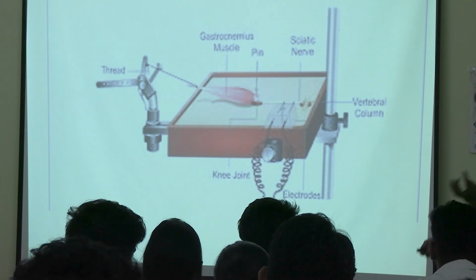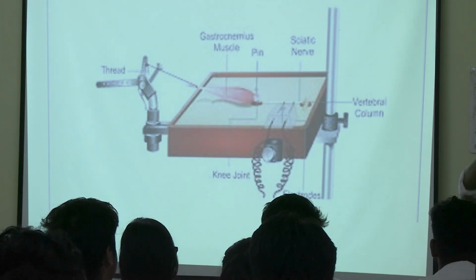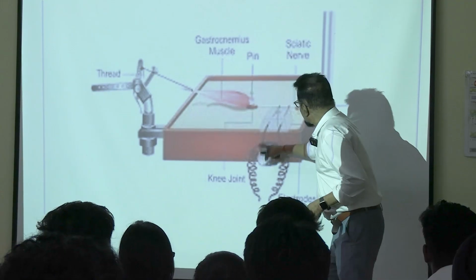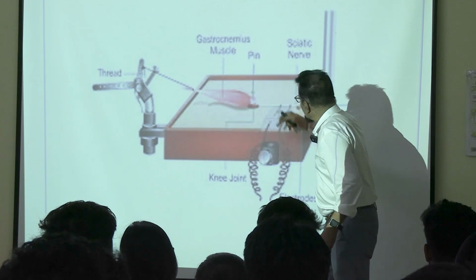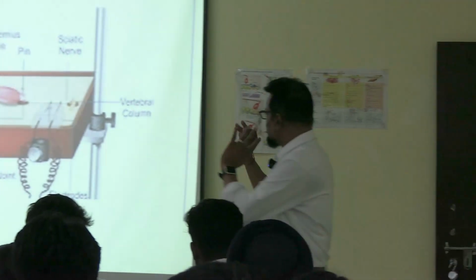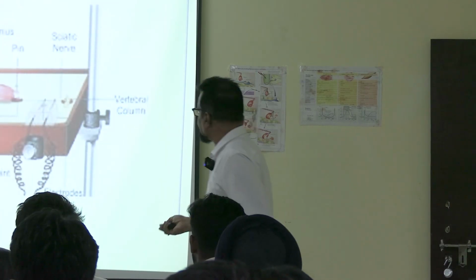This is filled up with solid wax, so you can pin up the joint with the wax. Now, the nerve is there. These are the two stimulating electrodes. You place the nerve over them. So this is the arrangement of the myograph with the writing lever and the muscles.